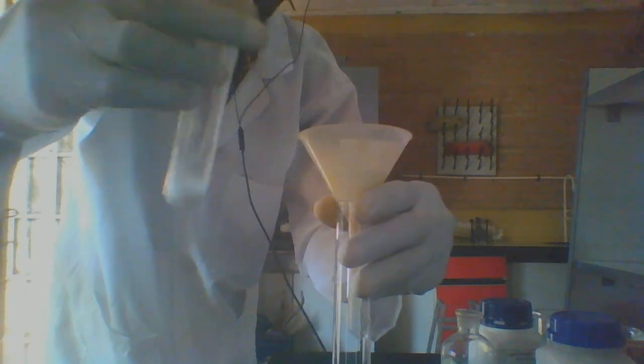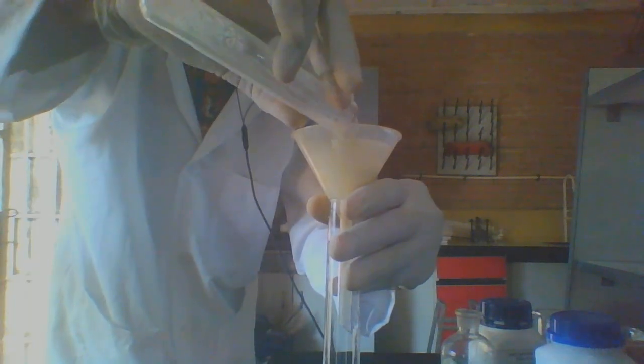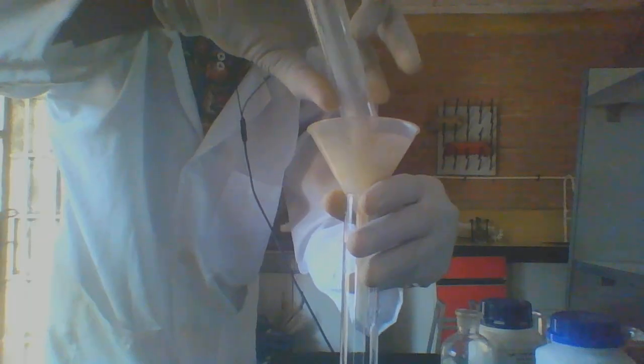So the lead is now in the filtrate, and the residue remains starch. Starch is the residue. So I filter, and I'm going to allow it some minutes to filter very well.